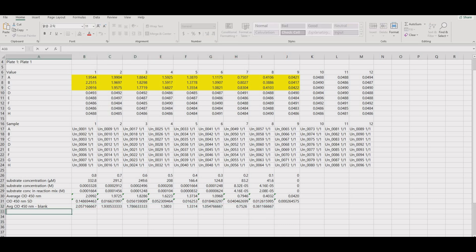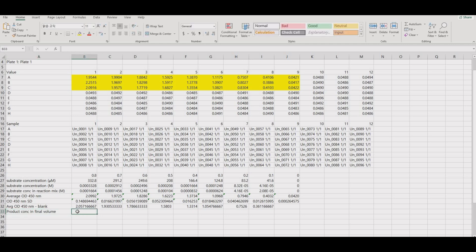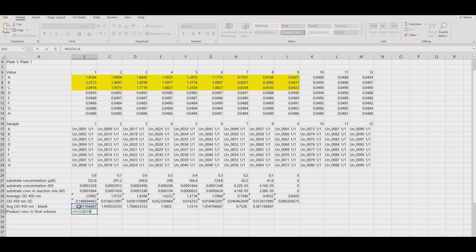Use the Beer-Lambert equation to calculate the actual concentration of product formed in the final volume. The path length is 0.18 cm and the extinction coefficient is 5.9 times 10 to the 4.